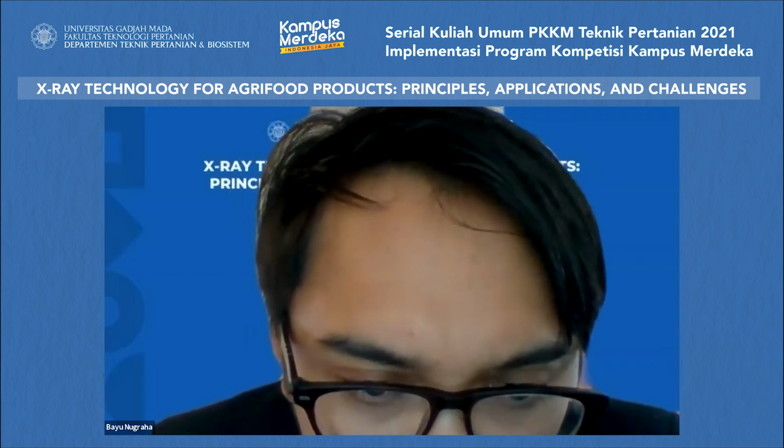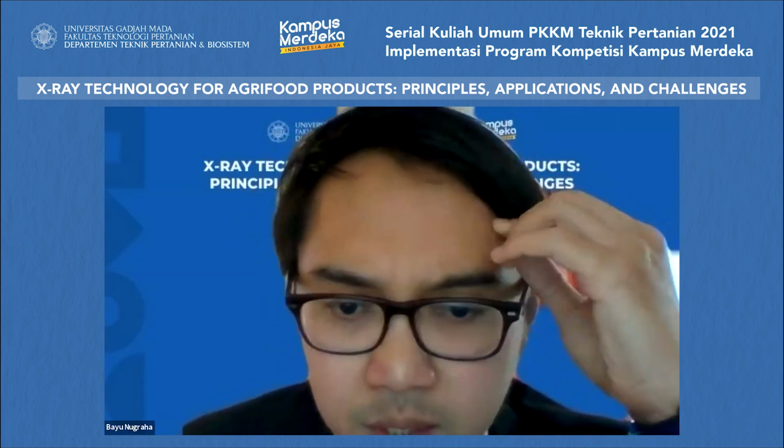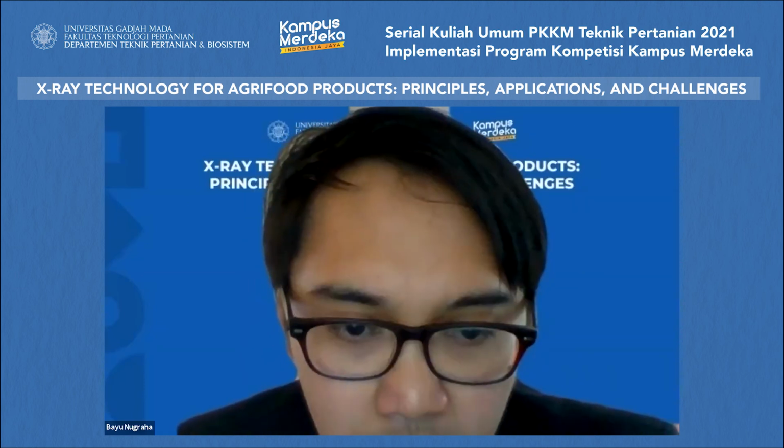Next question is from Nizarudin. He's working at a seed industry in Indonesia. The question is, is it possible to use the X-ray technology to evaluate the dormancy of the seed, which is caused by impermeability of the coat? If it's possible, how much is the estimated cost of the instrument investment?